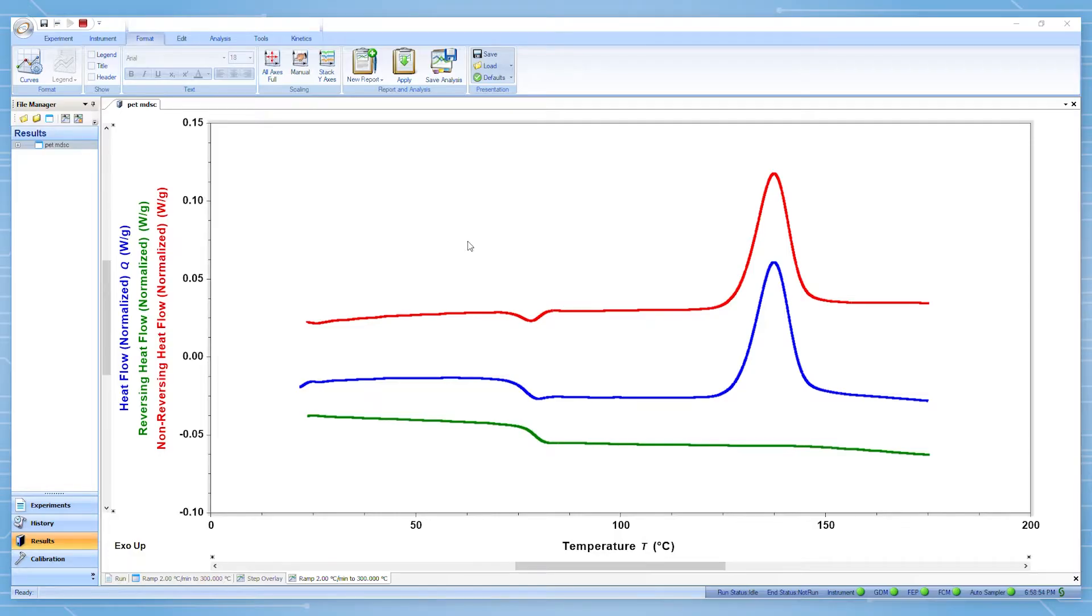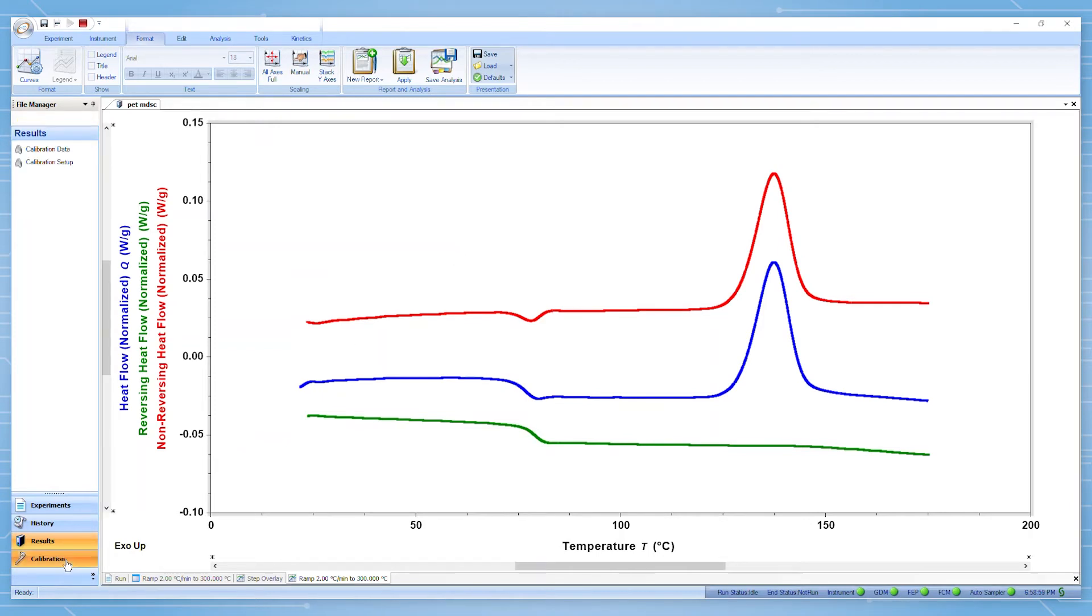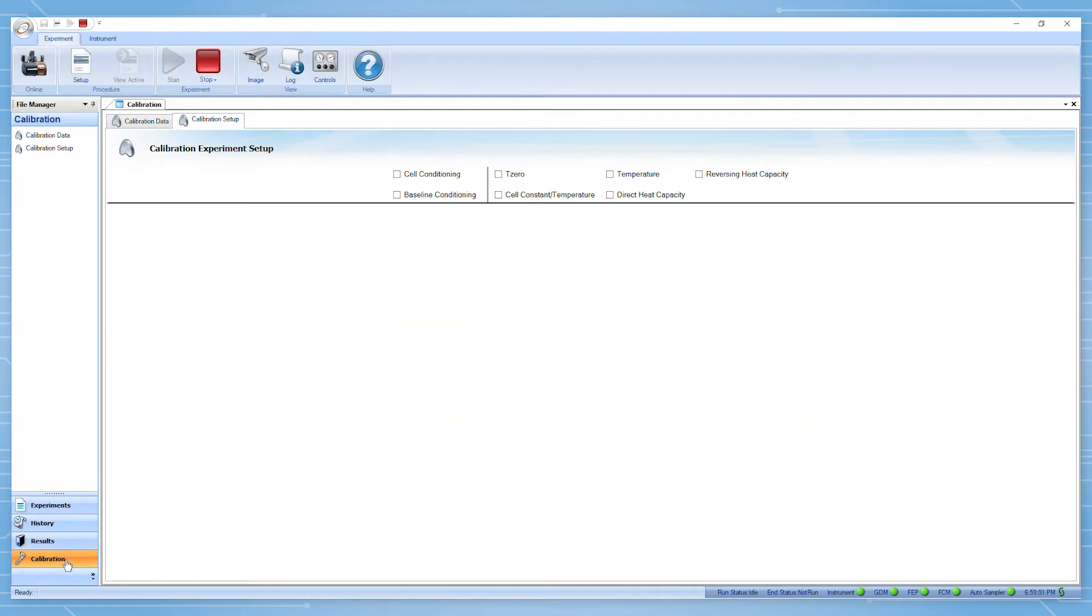To begin, navigate to the calibration pane within the TRIOS software. You need to have performed your heat flow as well as your cell constant and temperature calibrations prior to the reversing heat capacity calibration. Remember, it is best practice to perform all of your calibrations using the same pan type you'll be using for your actual experiments.